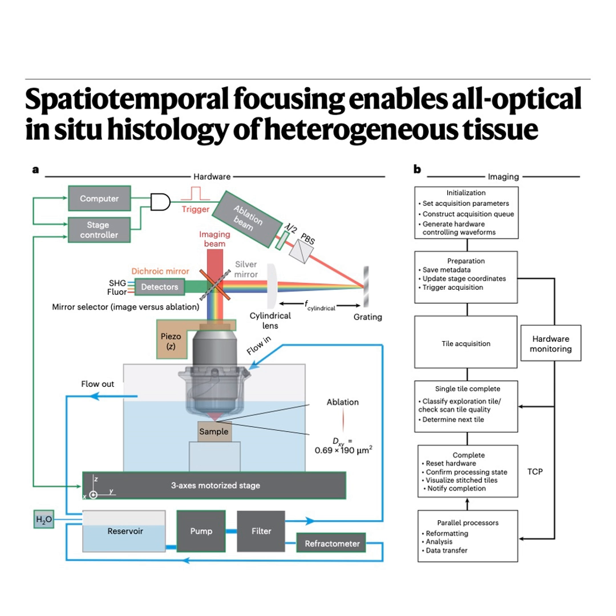Got it. So it images, figures out what's bone, what's soft tissue, and then it moves to the cutting step. Right. And the cutting, well, that's where the real engineering marvel comes in. It uses temporal focusing-based laser micromachining. Temporal focusing. And this uses light as a scalpel. How does that even work? Wouldn't that much energy just cook the surrounding tissue? That's the clever part. It uses extremely short, femtosecond short, laser pulses. These are incredibly intense bursts of light. Femtosecond, that's a millionth of a billionth of a second, right?